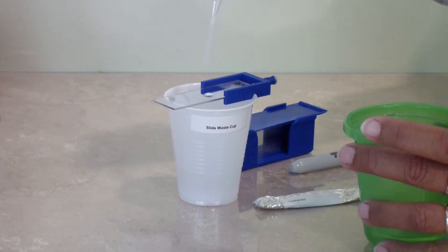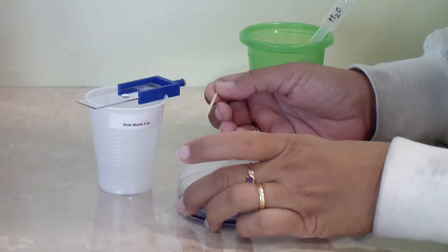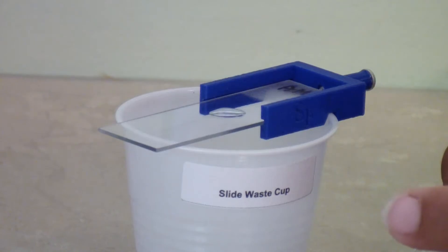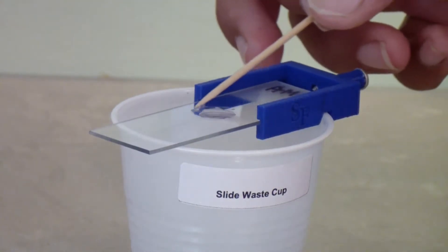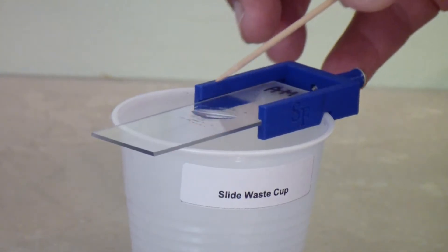With the transfer pipette, add a drop of water to the center of a glass slide. With a toothpick, touch the colony you are interested in and put the tip of the toothpick in the drop of water on the slide. Gently stir in the bacteria. The water may turn slightly milky as the bacteria mix with the water, but do not panic if you do not see that.